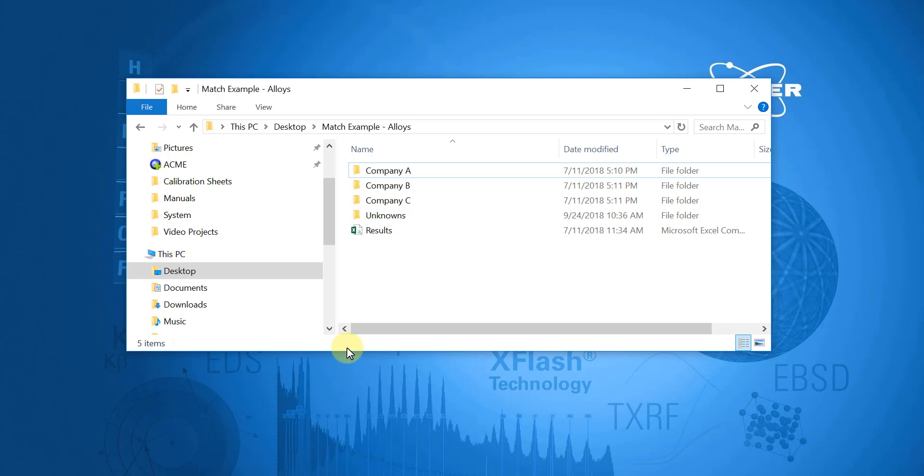The first step is to collect the raw data for all of the reference materials and all of the unknown samples, which in this case I've done ahead of time. However, when doing so, it's important to ensure that the analysis surface of all the samples are clean and to pick an area on the sample that is as smooth and flat as possible.